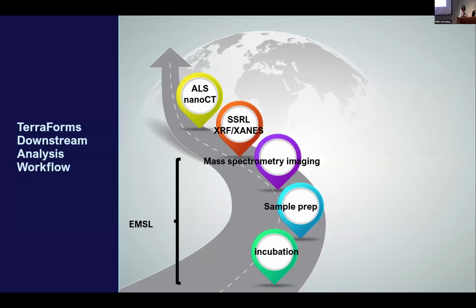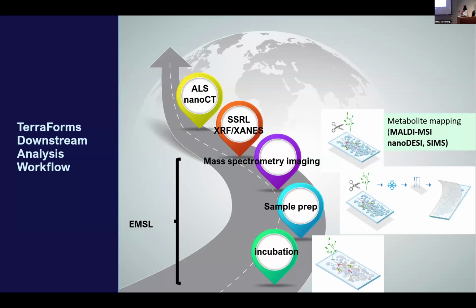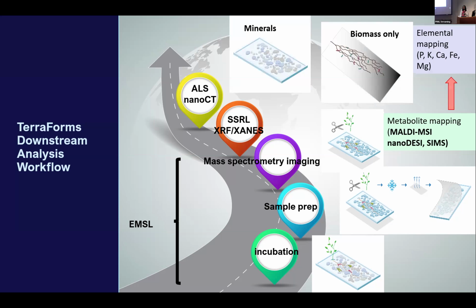Those workflows have been developed where we start with incubation and sample prep, and we can remove biomass from these platforms, separate the biomass while maintaining its structural integrity, and then look at the biomass separate from the minerals or soil-like aggregates that are present in the platforms themselves.